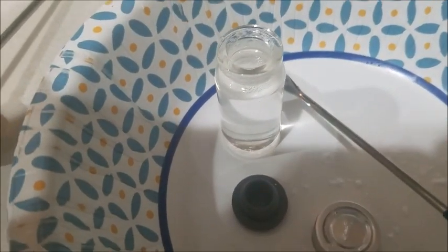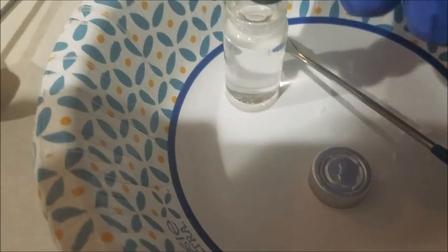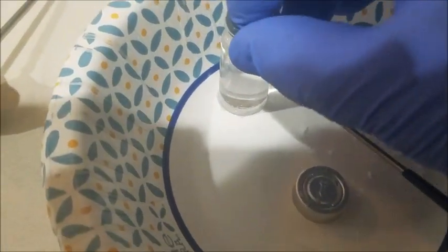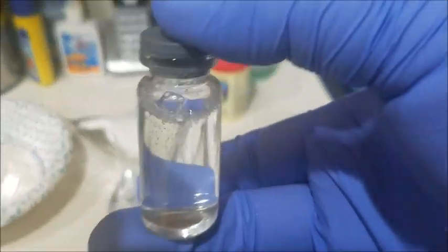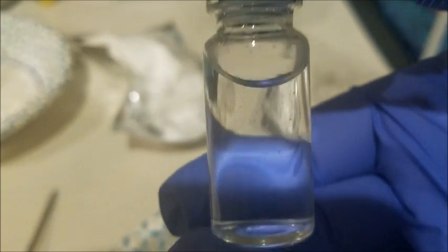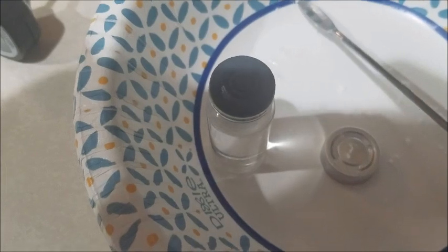Now we're going to put our rubber stopper cap on the vial. That way we have less chance of spilling this. And then we're just going to give it a gentle shake. Careful, it's very hot. And you know you've done it right when you look inside and there's no more lidocaine powder. Had to put that down there for a second. Got a little bit hot. And there you go. You have 10 milliliters of 2.5% lidocaine USP.